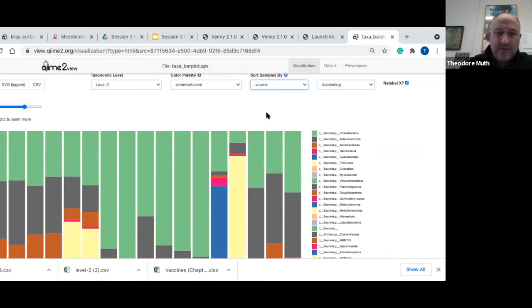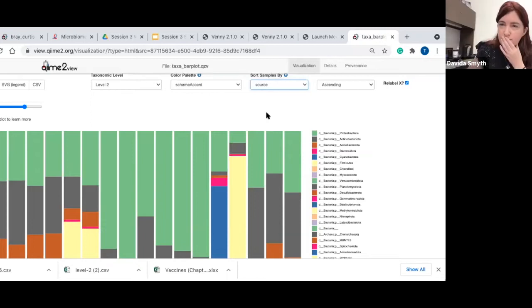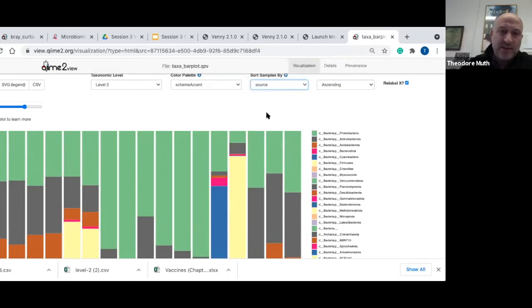Species is iffy. So if I'm looking at these data with students, I'm comfortable saying that if we see different genera there, I'm confident in that. But I don't try to make too much out of the species level, if that's what you're asking. If I had paired end data here, I would probably feel a little more comfortable going down to species level. Anything else? That's it for now.